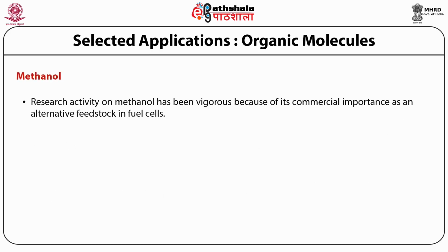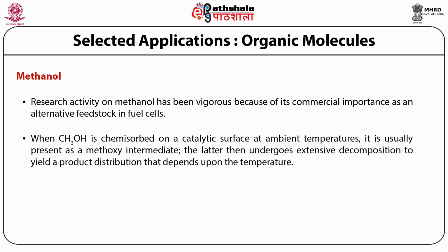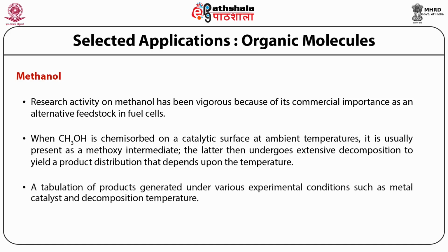Methanol: research activity on methanol has been vigorous because of its commercial importance as an alternative feedstock in fuel cells. When methanol is chemisorbed on a catalytic surface at ambient temperatures, it is usually present as a methoxy intermediate. The latter then undergoes extensive decomposition to yield a product distribution that depends upon the temperature, a tabulation of products generated under various experimental conditions such as metal catalyst and decomposition temperature.